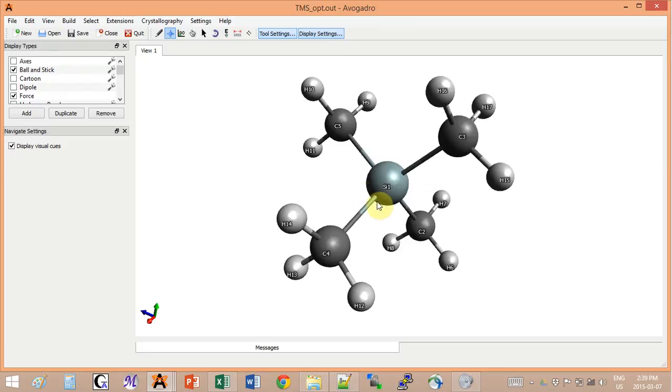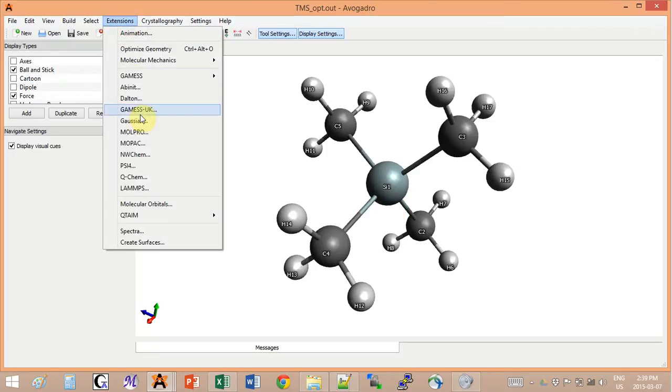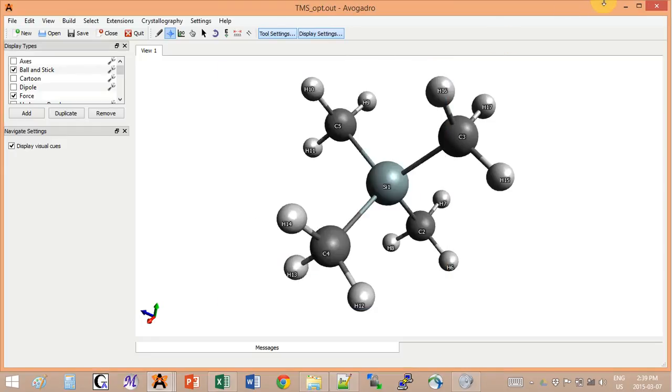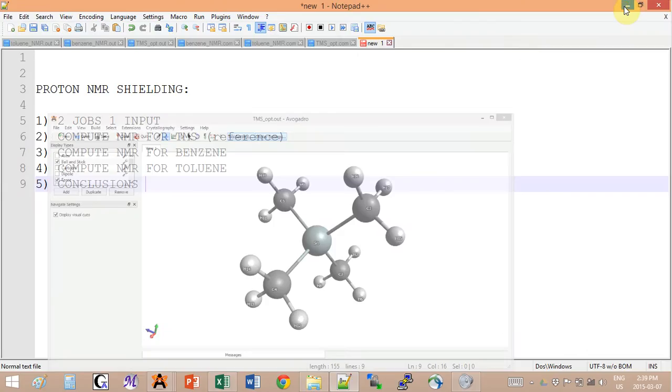Basically you have a silicon atom surrounded by four methyl groups. We're gonna create the Gaussian input for this and then add more stuff to the basic input. When you have generated your first input file, open the notepad.